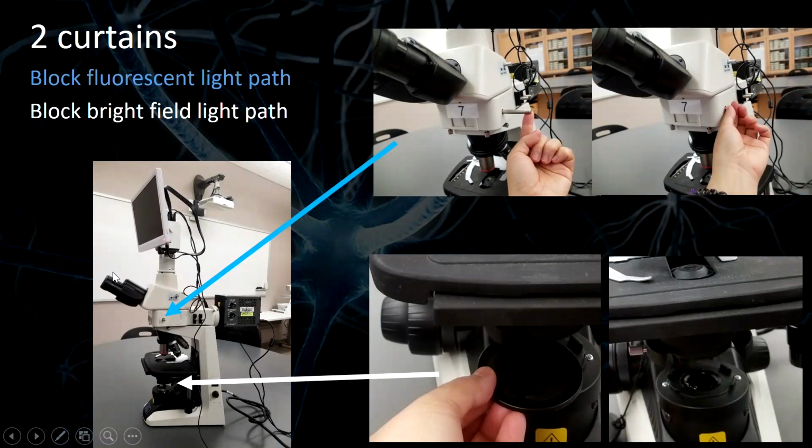Okay, there's something special about the fluorescent microscope. There are curtains. It's only me who calls them curtains. I think that's the best name for them. Nobody else calls them curtains. I don't know why. Okay, let me show you what the curtains are.